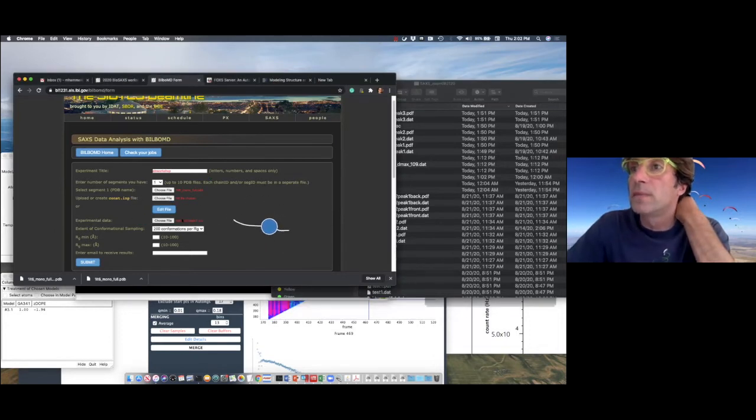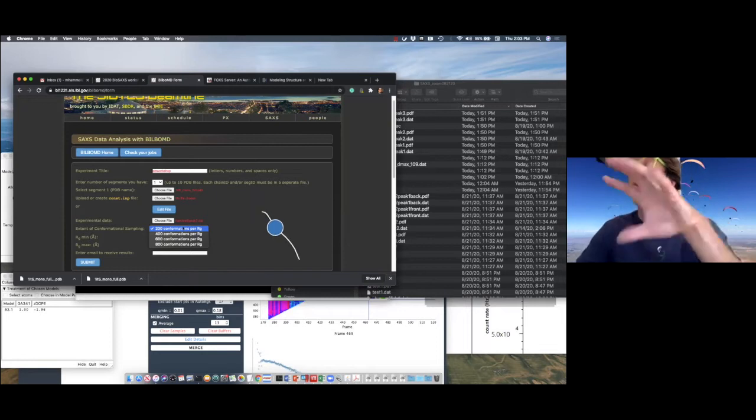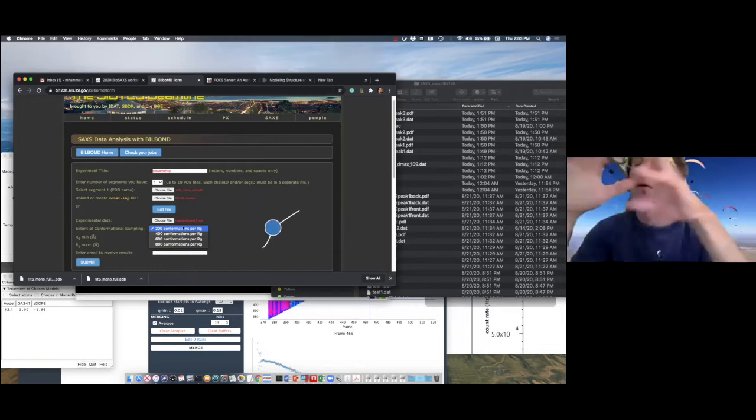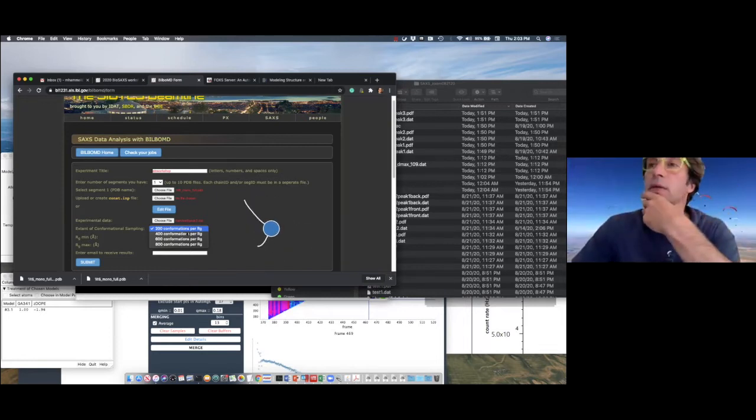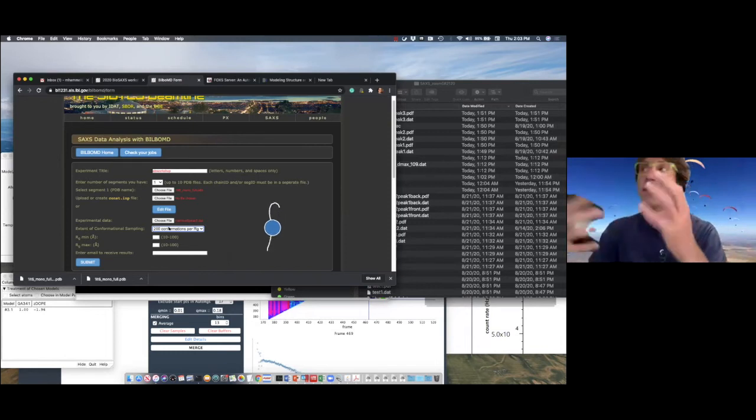That's right here. Conformational sampling: the more per Rg, the more conformers you have. So if you have something very large with multiple domains and long linkers, I recommend you do 600 or 800. This is a very simple case where I want to move only the linkers and optimize the fit to the SAXS data.